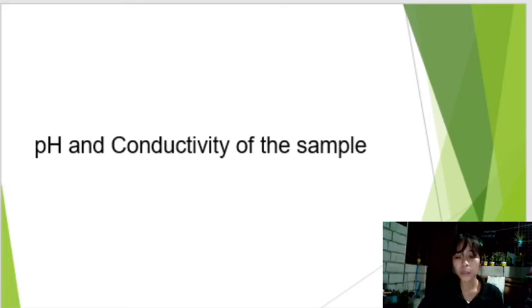Dun po lalabas yung mga incorrect results. And it can lower the conductivity. Dun po mahihirapan po tayo at maapektuhan po doon yung repeatability ng measurement. Kung gusto po natin dapat 3 pong pare-parehas, hindi po natin yung magagawa. Kaya need po talaga yung pH between 4 and 7.